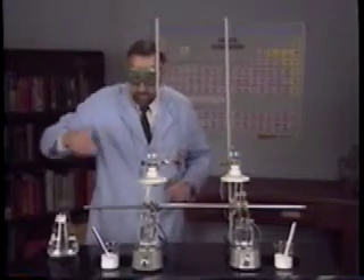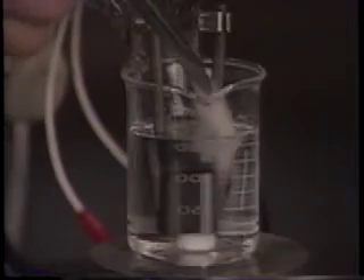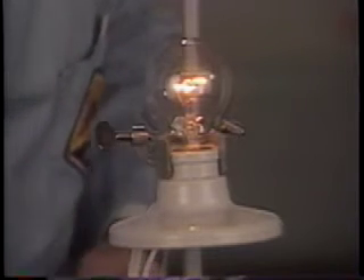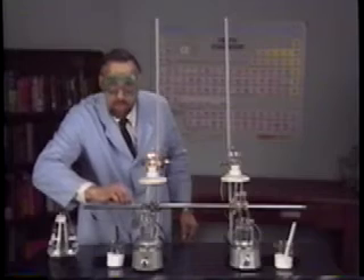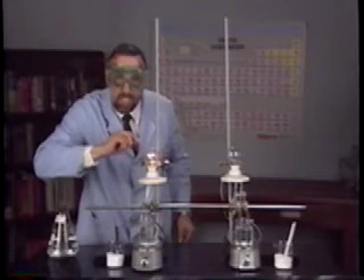Now, into this beaker, let's put some of this white solid number one. Oh, and look what happens — the light comes on! When solid number one dissolves in water, it conducts electricity. It is an electrolyte.